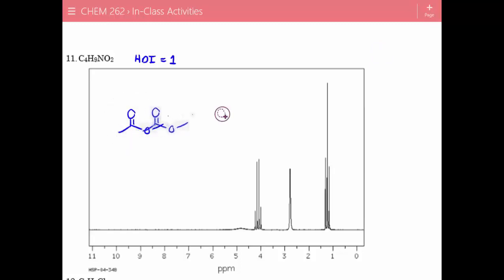So let me move this over. And this is one you may want to try guessing and checking on quite a bit. But one thing I have noticed is that this peak at 4 probably corresponds to protons coming off of here, just like we've already seen. And then there's a triplet over here, which is probably these terminal methyl groups.